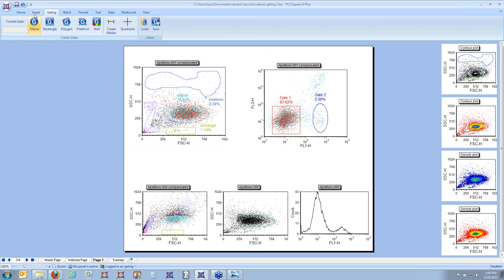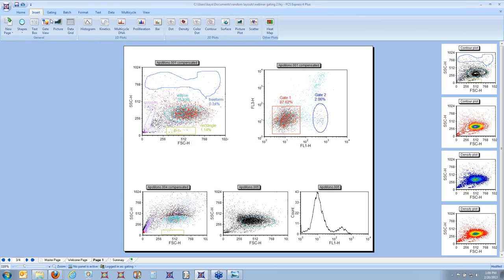And you might be wondering why that's the case. So to show you what I mean, I'm going to come up to the Insert tab and pull up a gate view, and let's take a look at the legend of the gates that we've created so far. So right now we have a mixed population inside of the Gate 1. We've got heterogeneous colors of red and teal, and that's because right now Gate 1 is at the same level in the gating hierarchy as ellipse.